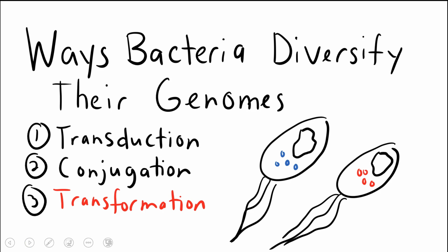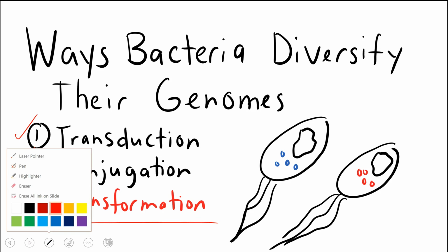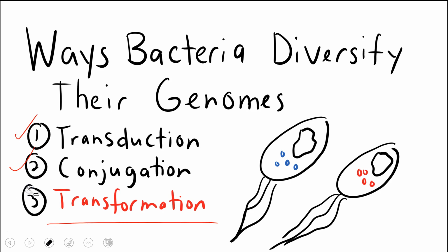Okay, so what we'll talk about next here is some of the AP biology surrounding ways that bacteria diversify their genomes. There are other screencasts that talk about transduction and conjugation as ways for bacteria to diversify their genomes. I'm going to focus here on transformation. Okay, so transformation is an important one. We're using it, in fact, for the lab.